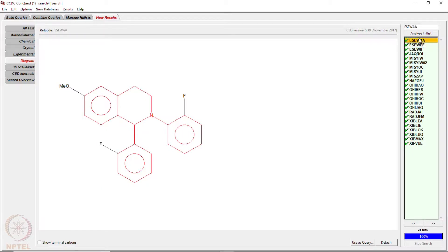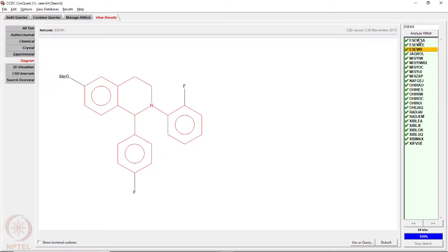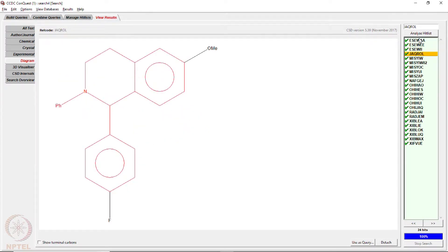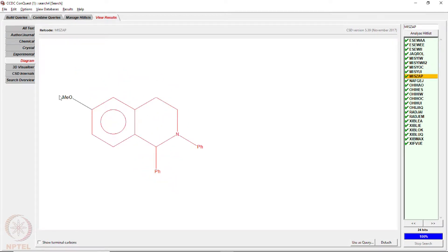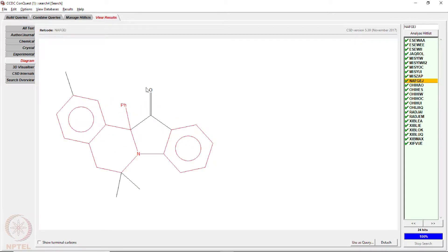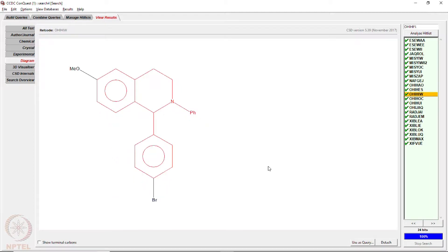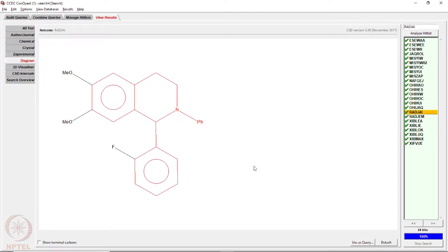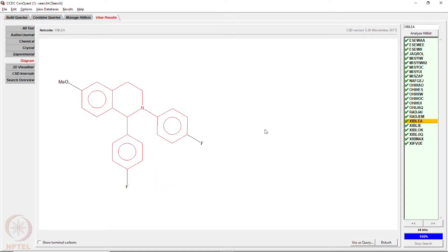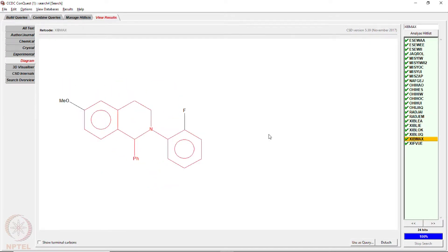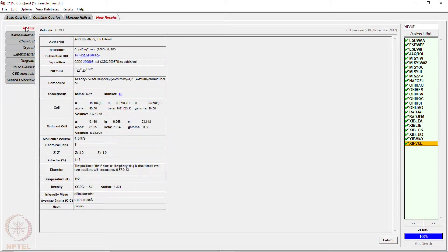Looking at those 24 hits, some structures contain fluorines, some without fluorine, some with no fluorine at all. Some have an extra ring at one point, some have bromo, some chloro, and then a dimethoxy substitution. Like this you have a large number of structures.